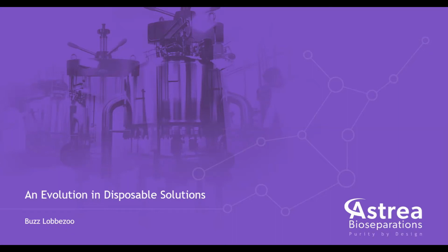Okay, so to get this going, I'm the Product Support and Development Manager at Astrea Bioseparations, which is formerly Prometic Bioseparations Limited. Today, I'd like to talk to you about disposable solutions, and in particular, about disposable columns.